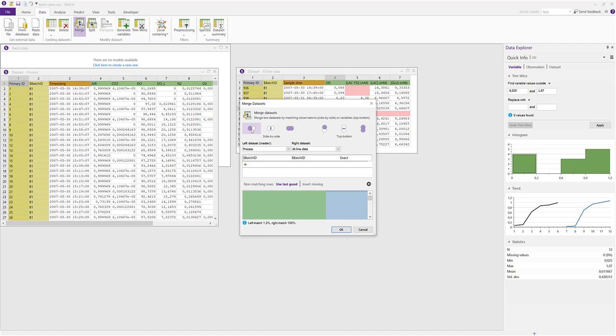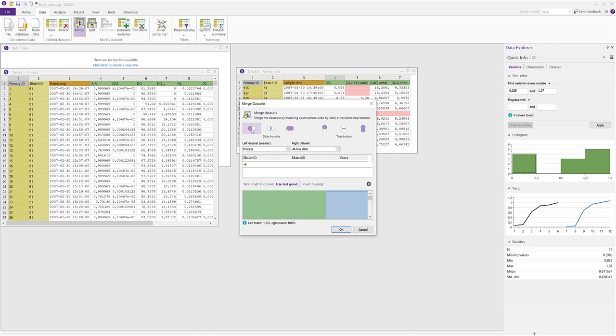The second option will only keep the rows that are common between the two data sets; this is called intersect merging. Finally, the third, the full merge option, will keep all rows from both data sets even if they don't match. We select the first merge option since we want to merge the at-line data into the process data. The process data will then act as the master data set with its timestamps intact, and the at-line data set will be merged into the master data set and then be deleted.